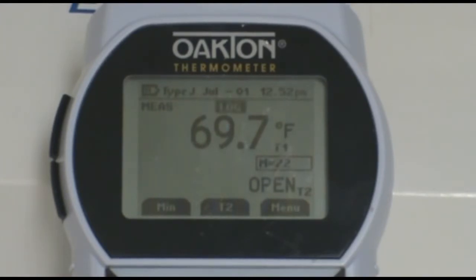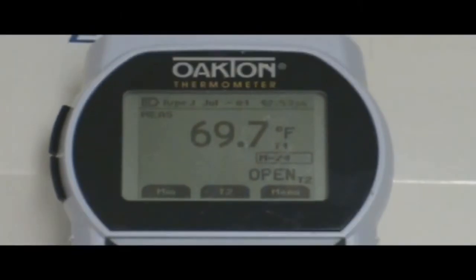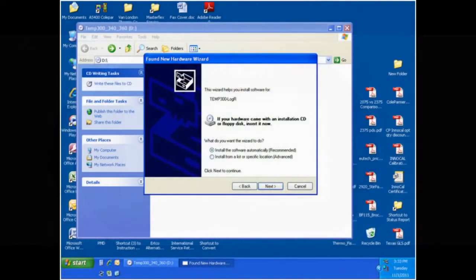At the top of the screen, you will see an icon that says log that will periodically blink to indicate that you are in auto logging mode. To stop the auto logging, the log or down button would just need to be pressed again.